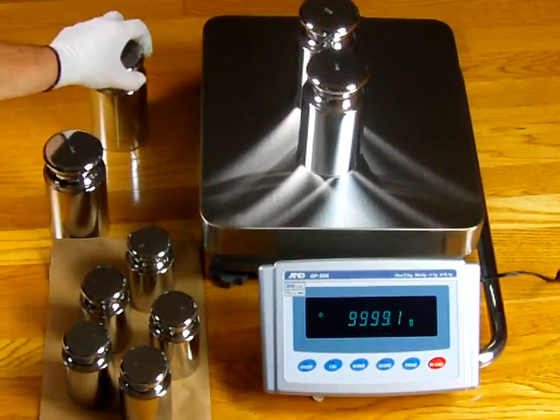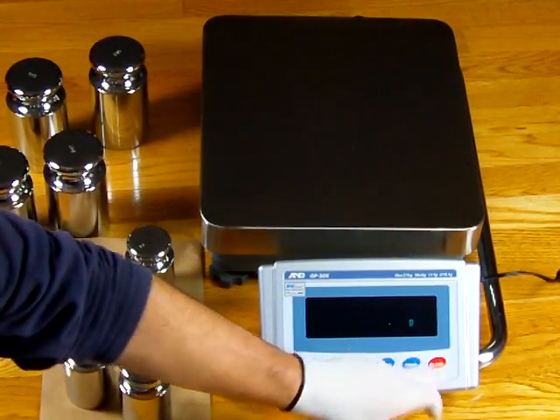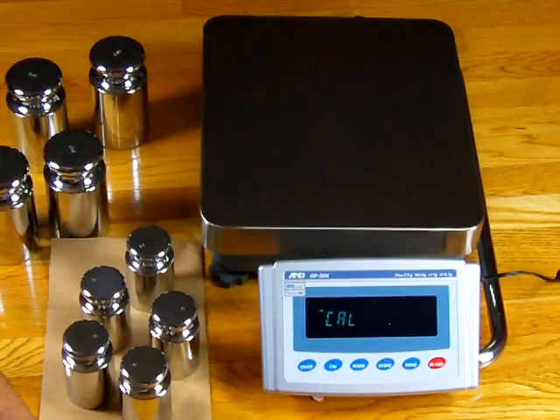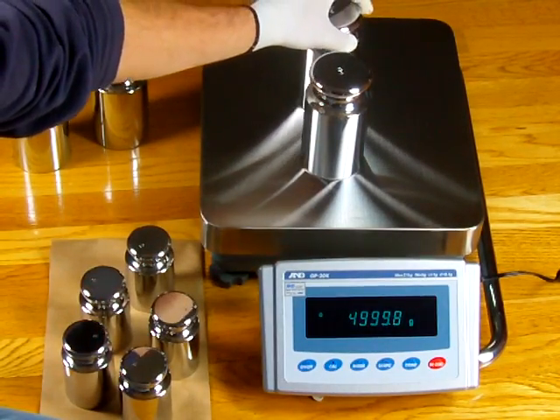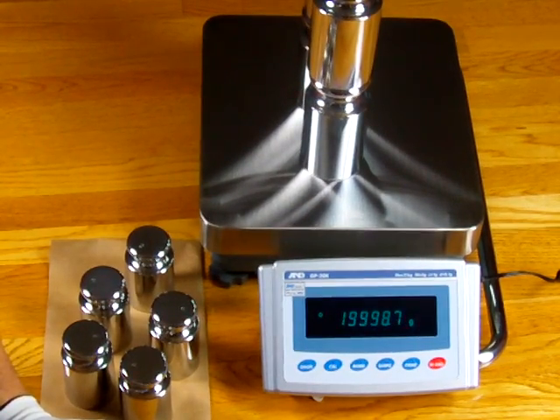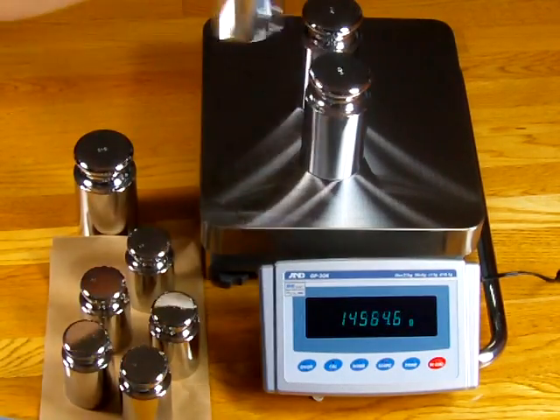We'll do one more internal cal so you can actually see that the balance is off. Zero out the balance, press the internal cal — it's going to do the motorized internal calibration. It stores the value with nothing on it, then stores it one more time at two points, and returns to zero. Putting on the weights: at 10 kilograms we're off by 7 divisions, at 15 kg still off, and at 20 kg we're off by 13 divisions. The scale is very repeatable, but we've got to fix that accuracy through an external calibration.